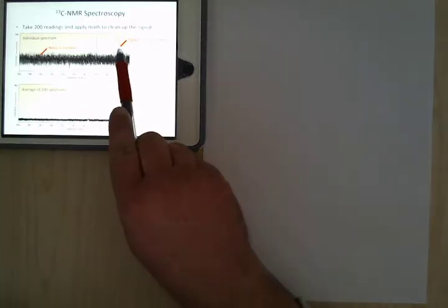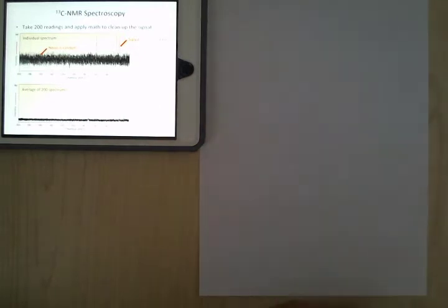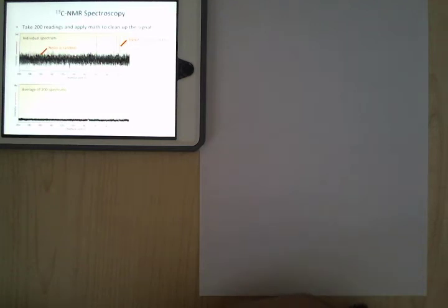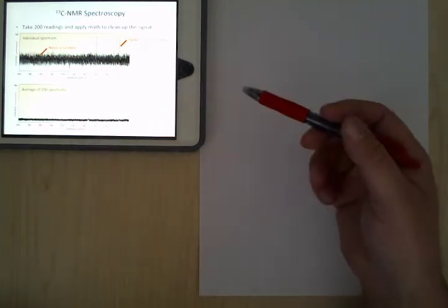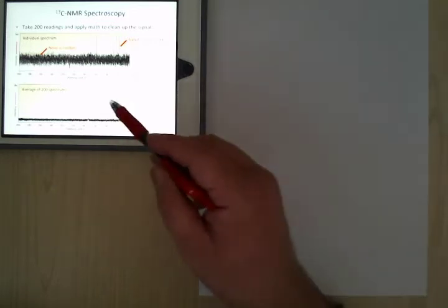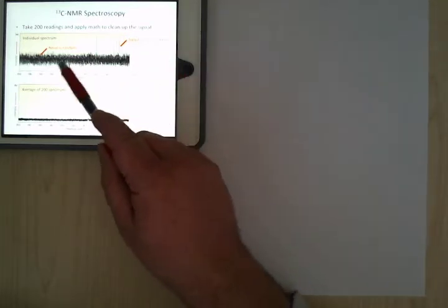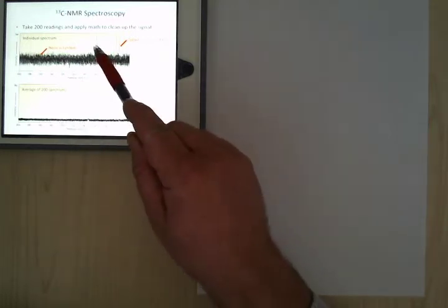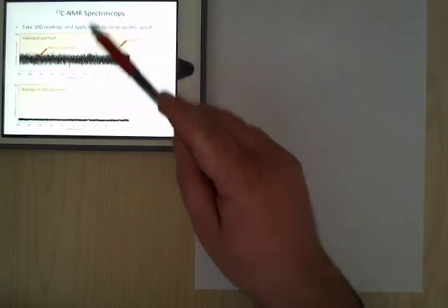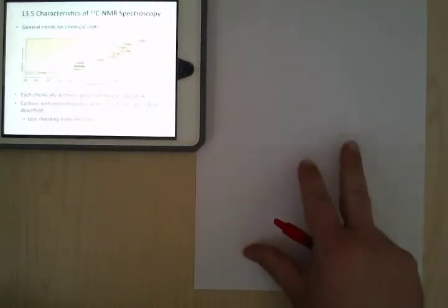Okay, but for an actual signal, what would happen is, heads, you get a point, tails, I don't get anything. So this is constantly added. After 200 flips, you're going to have 200 points, I'm not going to have any, and so you get a really big lead, which is a really big signal. So random noise is eventually going to go to 0, but the actual signals are additive, and eventually they'll grow well above the noise. Because if it's just noise, it's just going to go away. Okay. Chemical shifts.